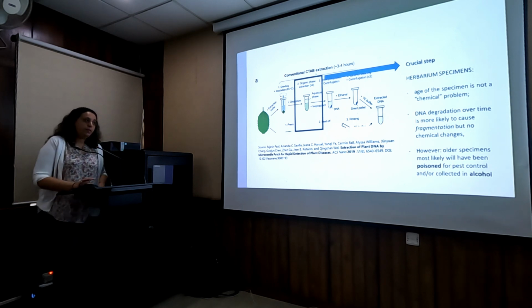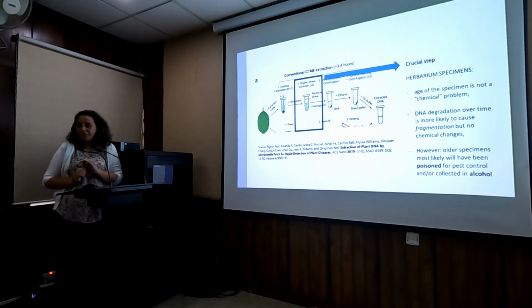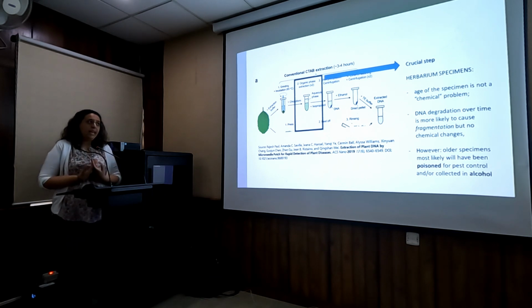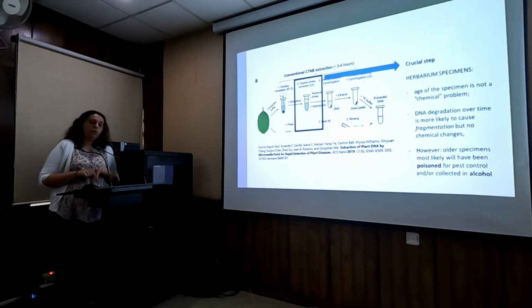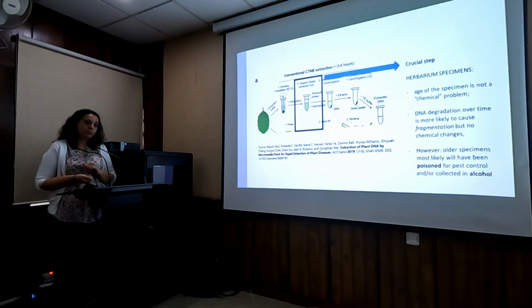And when it comes to herbarium specimens, I was just talking specifically about working with old herbarium specimens. This is from my perspective. The age of the specimen is not really a chemical problem. So when it comes to extraction, the extraction itself may not be a problem. It will be more fragmented, in smaller pieces, but you still may get good quality, clean DNA out of your specimens. The issue is different: usually older specimens have been poisoned a lot, so more than the more recent ones, they have been exposed to a lot of chemicals, and they are most likely also to have been collected in alcohol.